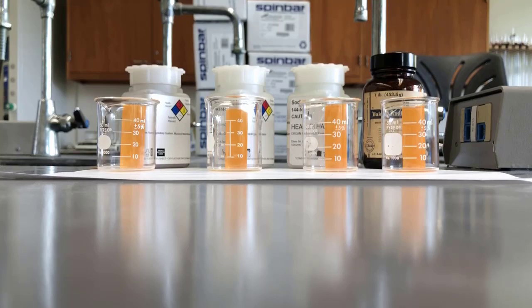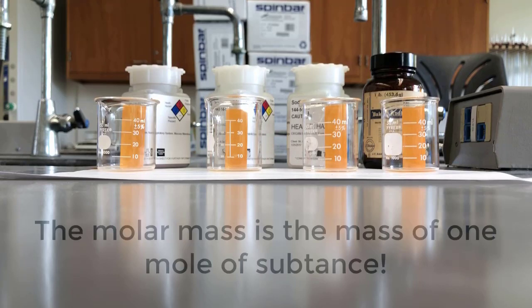So what I'm going to do, if you think about it for copper, if you look on your periodic table, it says that the molar mass of copper is 63.55 grams. So in order to get one mole of material, you have to weigh out 63.55 grams, and that'll give you one mole.